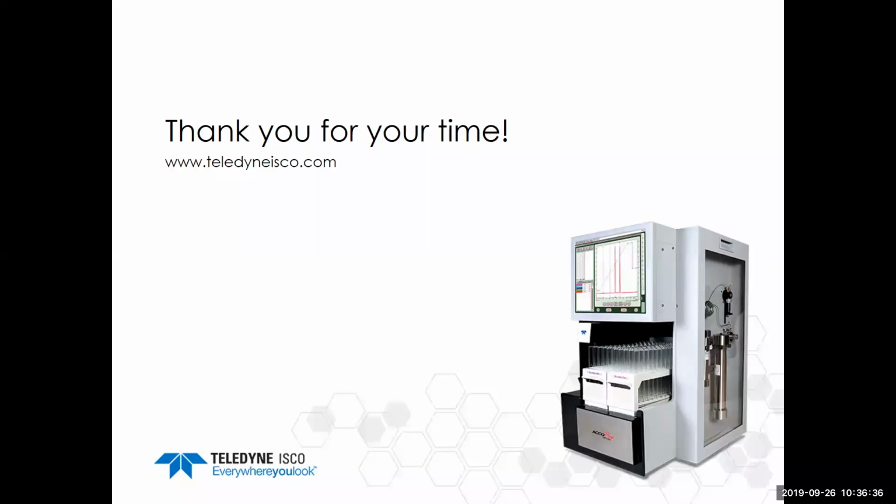The answer is it is not possible at this time. If you want to run a C18 analytical, we have matching C18 columns, and if you get in touch with me or your sales rep, we can work out how to run these experiments to go from your analytical HPLC to your preparative system for C18.